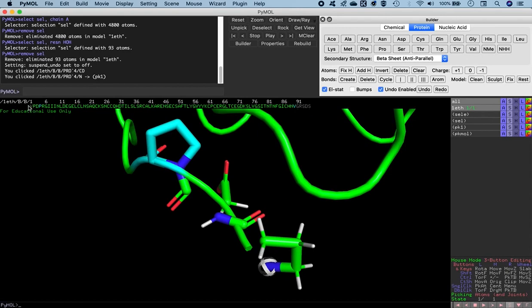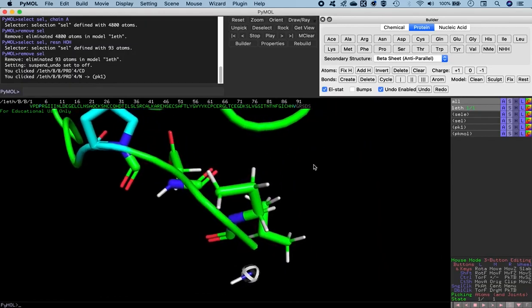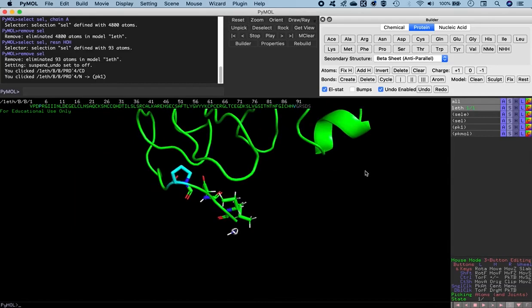So the last residue that's missing out here, starting from the N terminal, is the valine. So we select VAL from here. And there you go. So all the 3 residues that we're missing in the N terminal have been built now. Now, the structure is not represented in the licorice representation properly. So we'll just zoom out of this and make a selection of the first 3 residues that we just built.